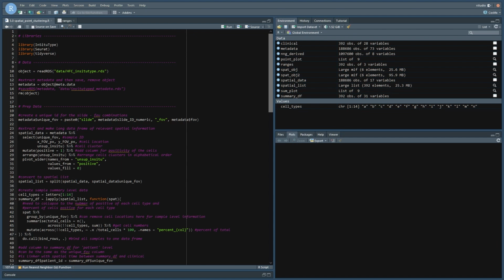So today, I would like to talk a little bit about cellular clustering in our samples. You can imagine if we have a bunch of cells that are different types, we can see whether or not the different types are clustering with themselves. That would be a univariate clustering, or if they're clustering with a different cell type. And remember, last time we had a handful of different ones.